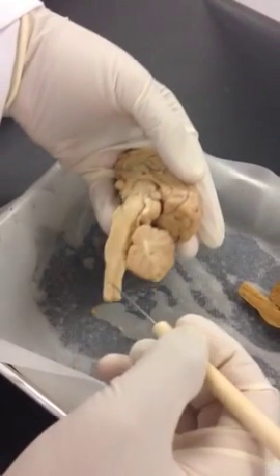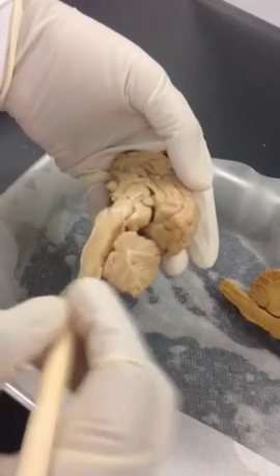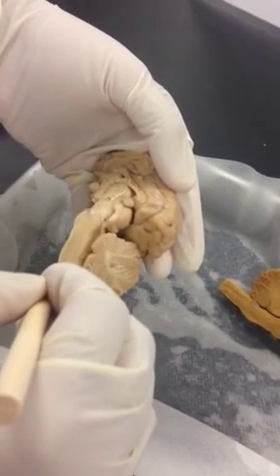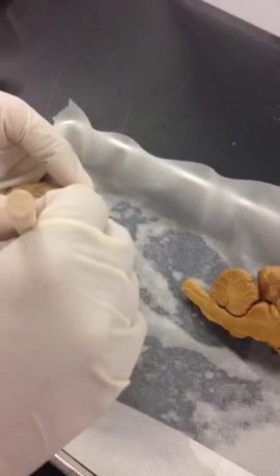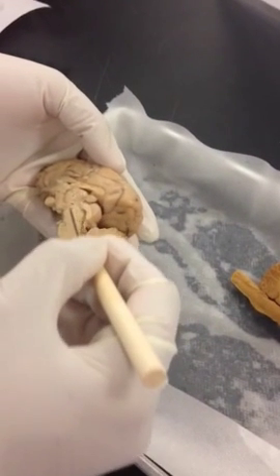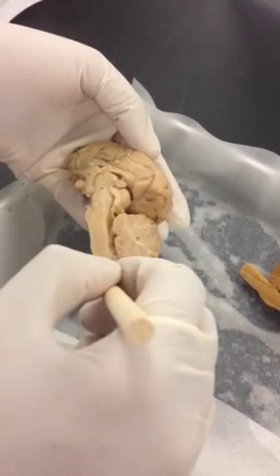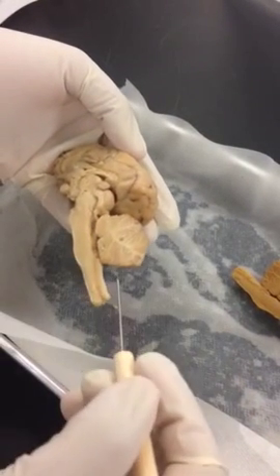And this is your spinal cord. The first bump, that's your medulla oblongata. The second bump, that's your pons. And then this is your cerebral peduncle, just below the thalamus in this view. So spinal cord, medulla oblongata, the pons, cerebral peduncle.